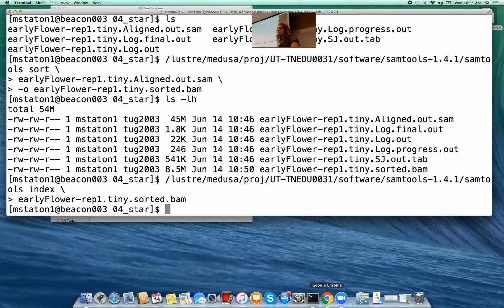This view is usually what makes me feel pretty comfortable that things are going well. I've got lots of reads mapping on top of our genes and lots of gaps in between the genes. You can scroll within these little boxes and see that, for example, here we have a lot of depth in this one region. These little bars up here are depth. It gives you a little coverage lane.